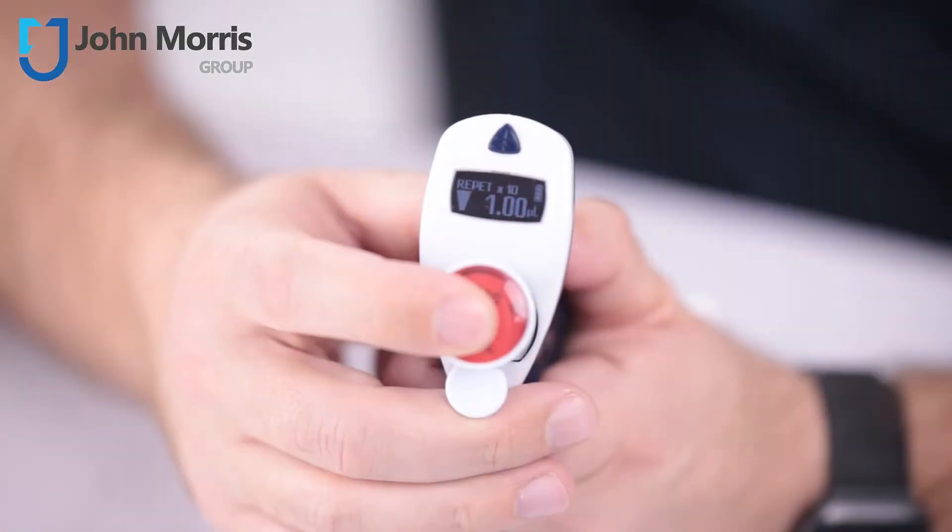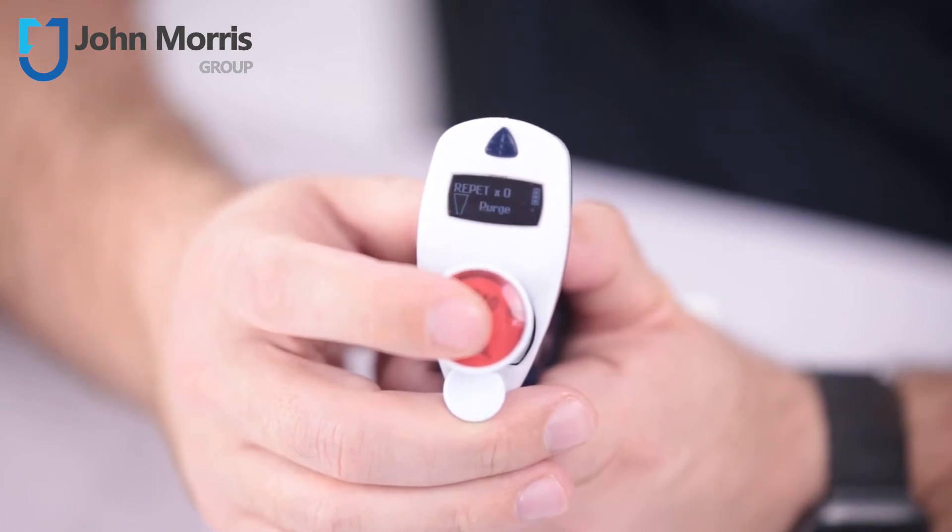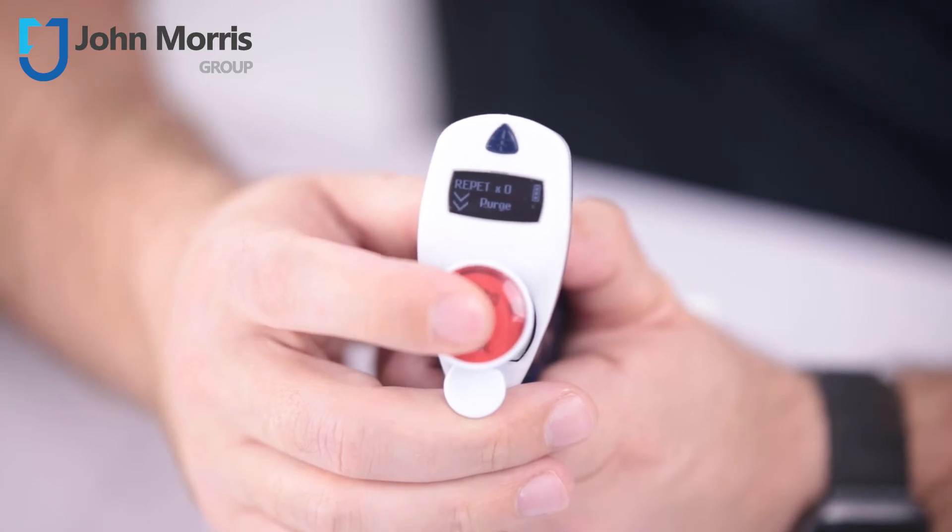Four: the M-Multi features a repetitive mode which allows you to aspirate one large volume and then dispense the exact same smaller volume or aliquot across multiple wells. This is very handy when dispensing a desired volume of reagent across a plate. There's also a reverse pipetting and a mix mode, and together this makes the Gilson M-Series a very versatile pipetting tool.